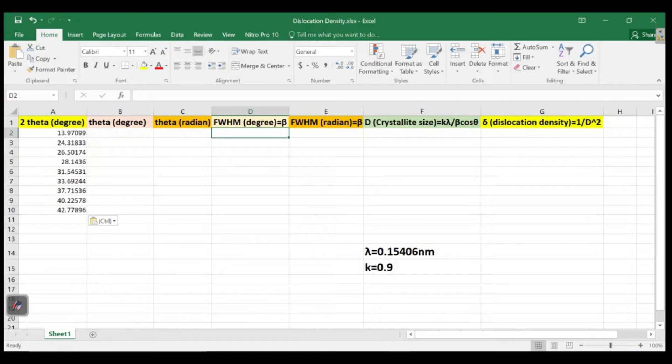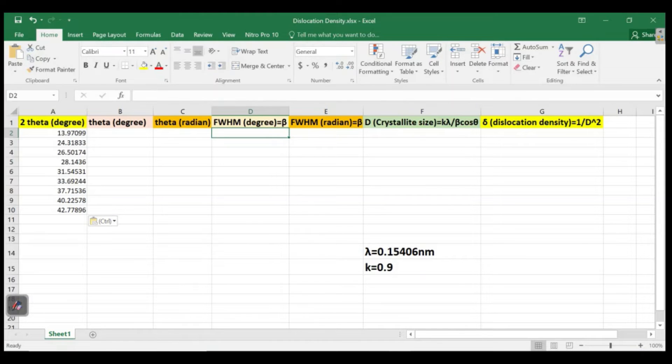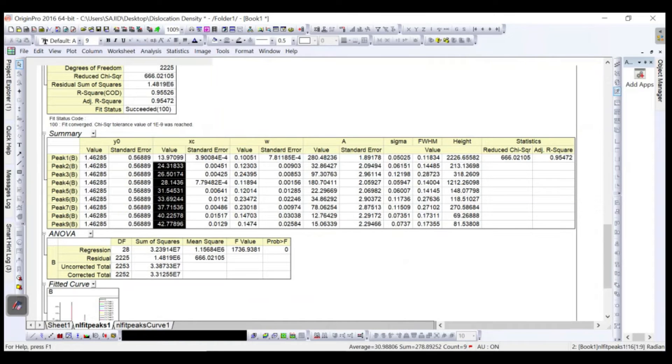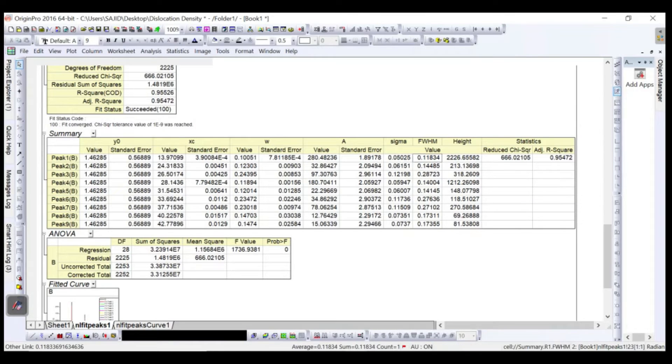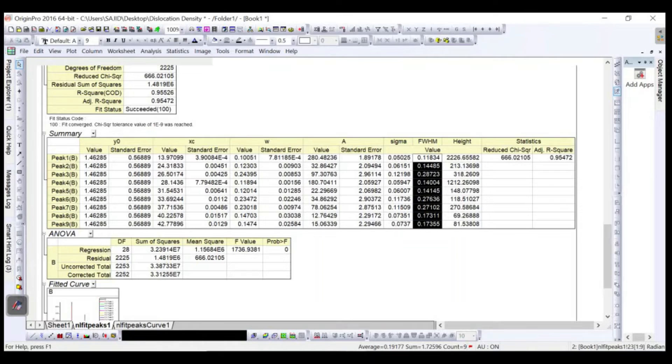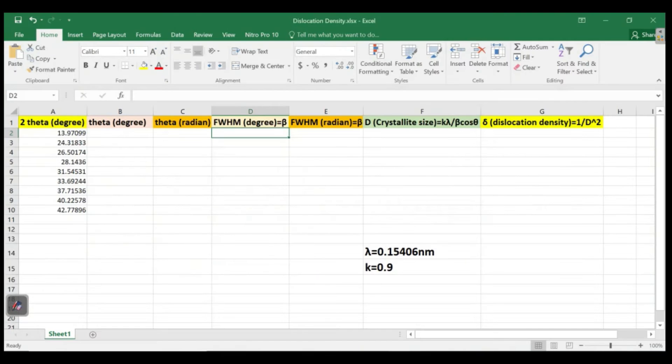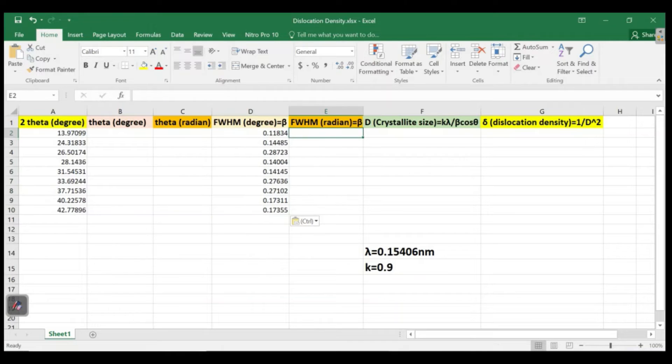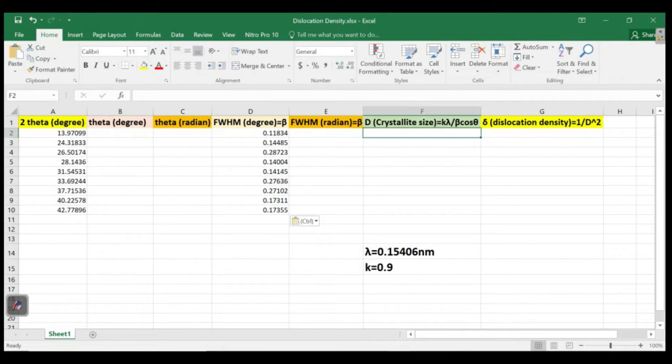Here we have the full width at half maximum. We can see that in this table here, this is the FWHM value. Control C and control V. Then we will also convert this degrees into radians and then we will calculate the crystallite size by the formula.